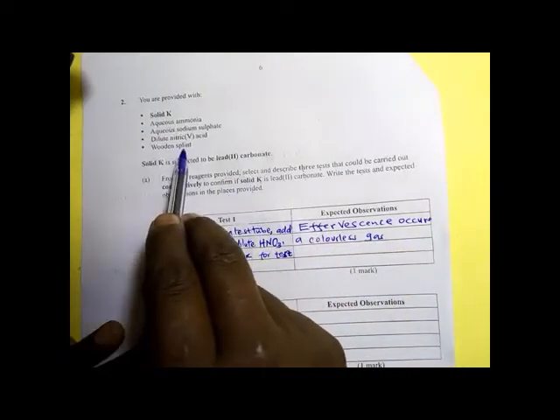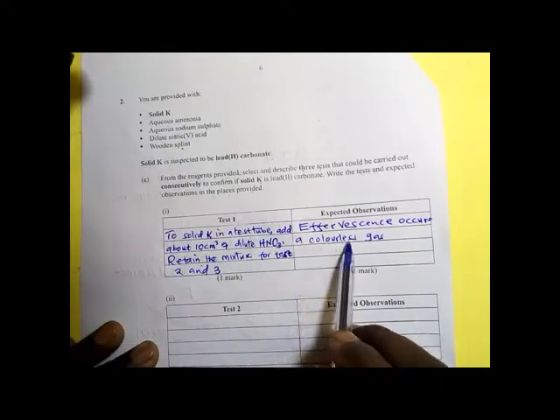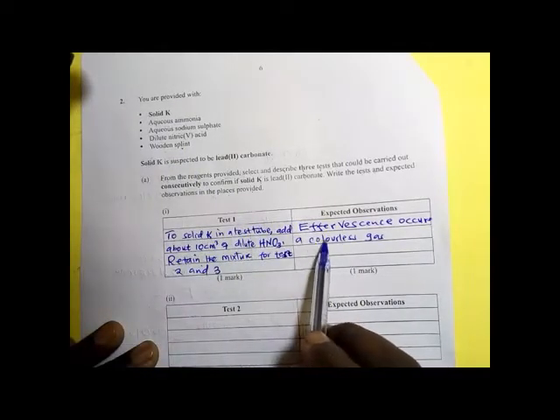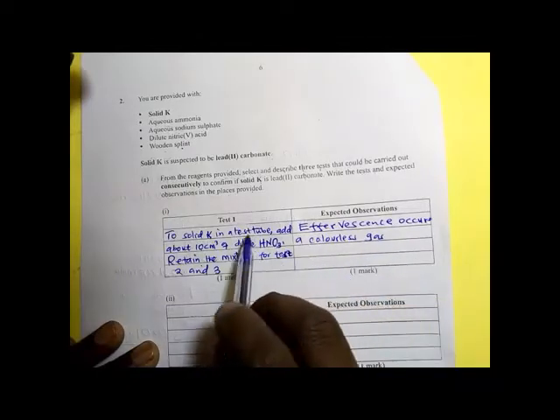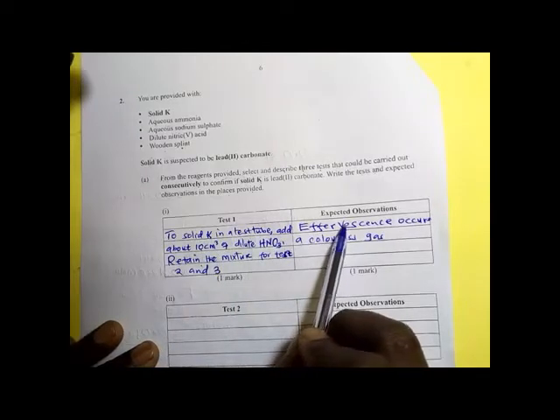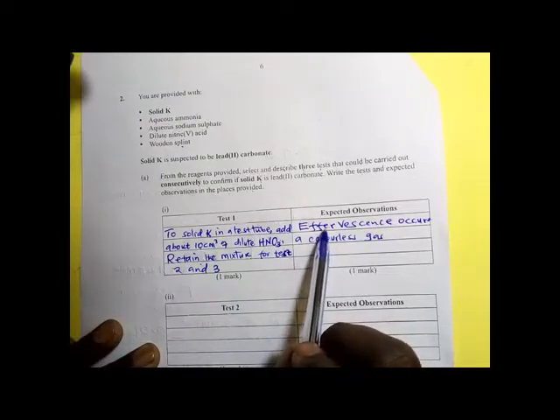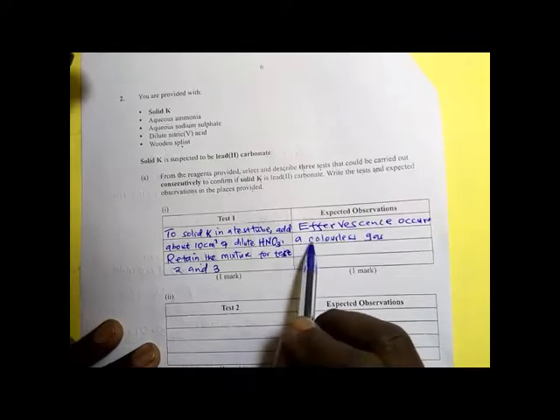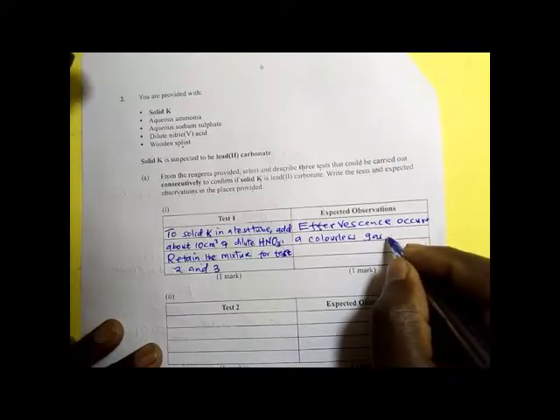Because you are given a wooden splint, now you will use that wooden splint. This gas, will it extinguish the wooden splint, or it will relight, or what will happen? So a colorless gas, we expect carbon dioxide to be produced. It is the carbon dioxide which will cause effervescence. Therefore, we know carbon dioxide does not support combustion. If you introduce a burning splint, it will go off, it will extinguish. Therefore, a colorless gas is produced that extinguishes a burning splint.